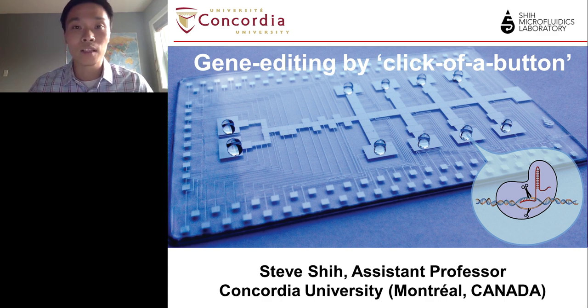And the way I sort of designed my talk today is through these learning objectives, specifically three of them: defining current paradigms of gene editing, identifying bottlenecks in the process of gene editing, and then I'll sort of describe some of the solutions that we came up with to automate approaches towards gene editing, specifically in the area of microfluidics. And so what I'll do is I'll start with defining current paradigms of gene editing.